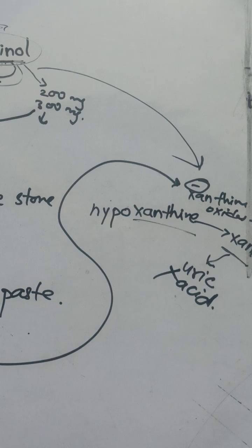The vehicle is just to facilitate stability, so that the patient can easily take it without feeling the bad taste, and so that a suspension can be made out of it. Your suspension should be sweet in taste, viscous, of smooth consistency, translucent, and uniform in its composition. Now let's talk about what things we require.